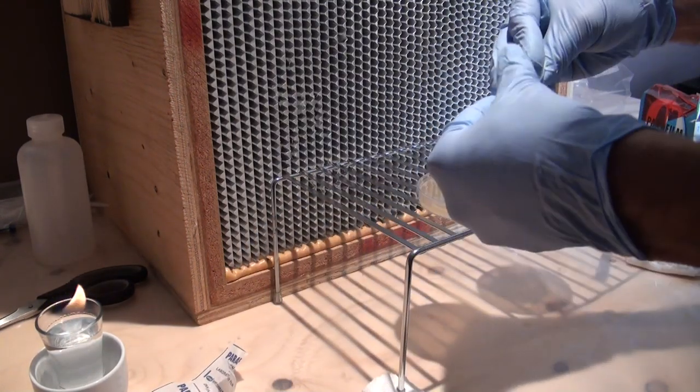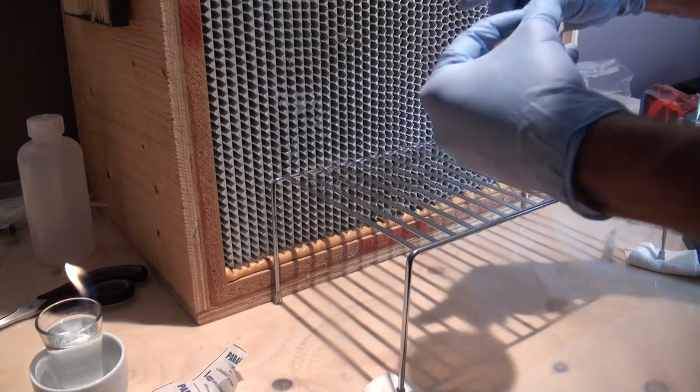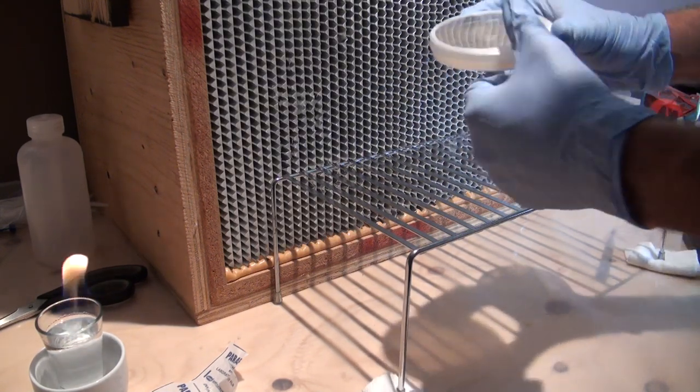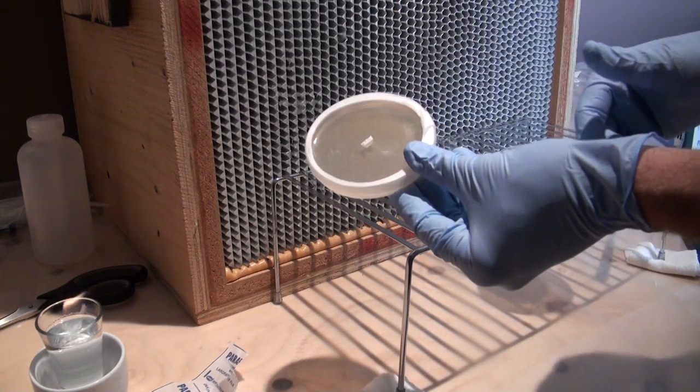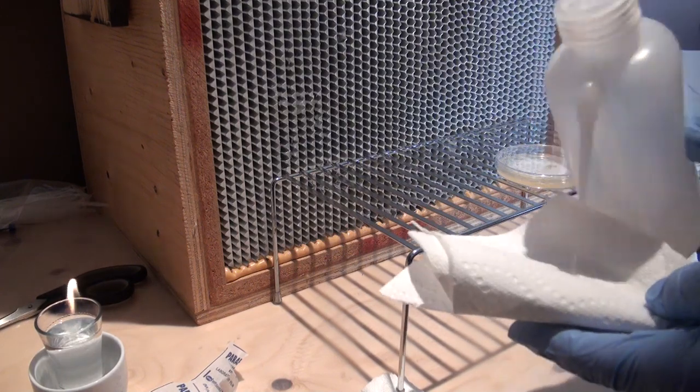Now take some parafilm, wrap your new dish, and that's it. This should start to grow out over the next couple days. I'm going to place that aside and we're going to go ahead and do the next transfer.